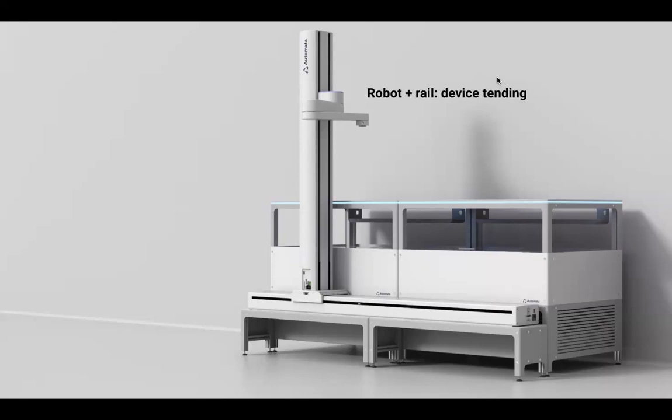So the robot and the rail. This is what I'll be referring to as the robot arm. What this allows is this robot arm, on the end of it, has a gripper that is able to handle SBS format consumables, labware. And what that means is that this robot is able to handle a lot of your samples and consumables. So it is able to move horizontally and vertically to cover a large space which it can access.